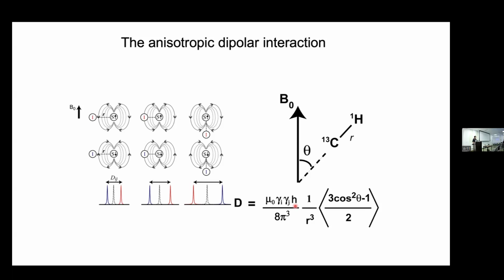The line width is a good estimate for that. Although you can beat the line, the precision with which you can determine the center of a line is much smaller than the line width because you can integrate the data, etc. So, roughly 10 times better than line width.